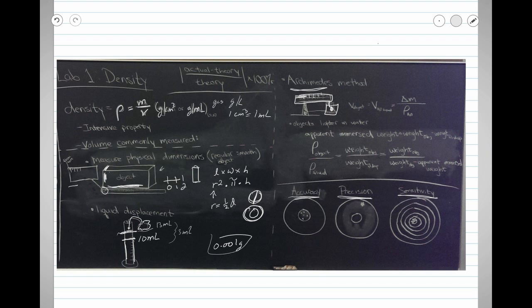So, are our measurements close to that? And are they kind of in the ballpark of 1, right? If we're throwing darts at the dartboard, are we close most of the time to this central point? And errors relating to accuracy are called percent error, and they are calculated by using the actual value minus the theoretical value divided by the theoretical value, and then you multiply that by 100% to get the percentage. That equation is actually up here.